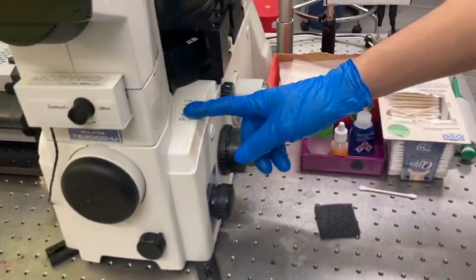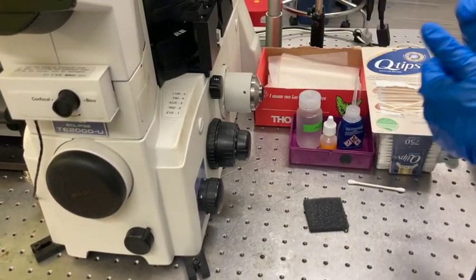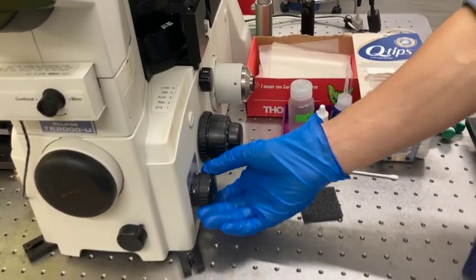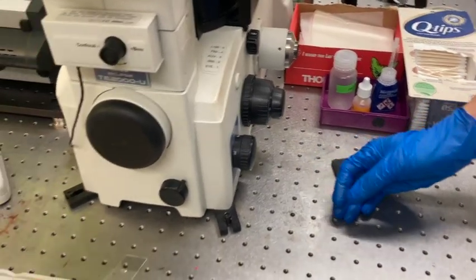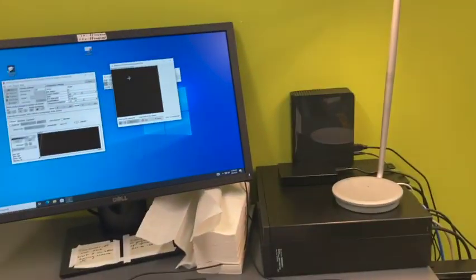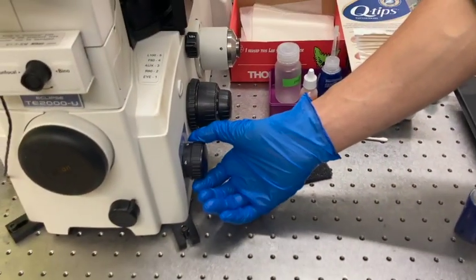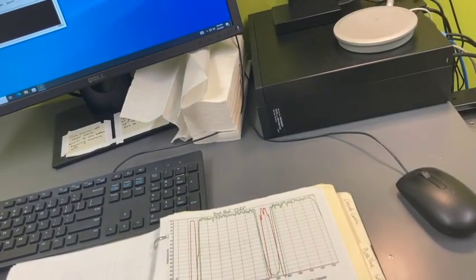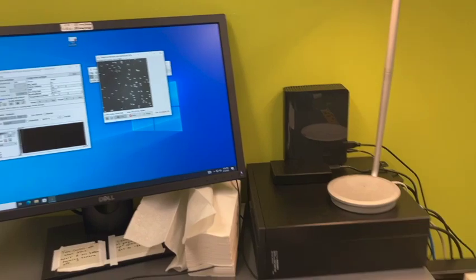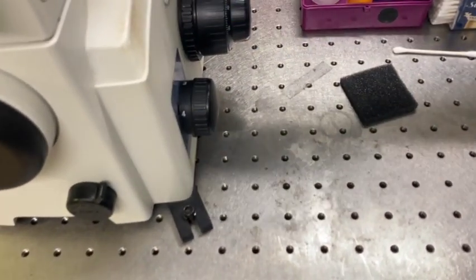So this is going to decide which port the light is going out. So don't freak out when you see nothing over there. It's just because somebody else might accidentally touch it or do it on purpose. Who knows? So the right port is going to be 4. It's kind of weird, but I think it should be 5 left. I don't know.